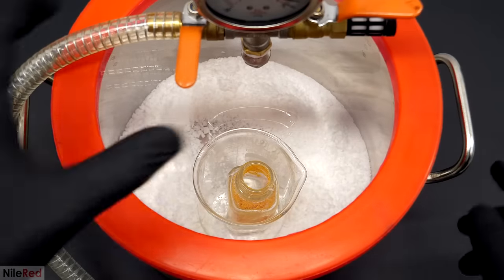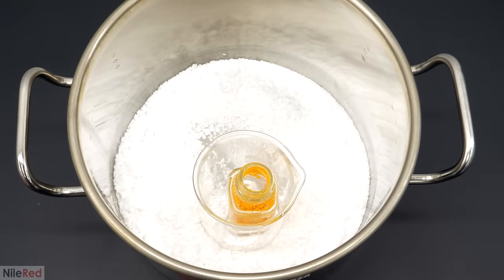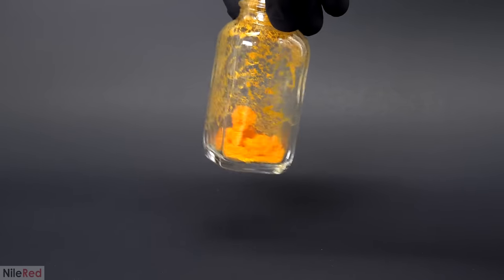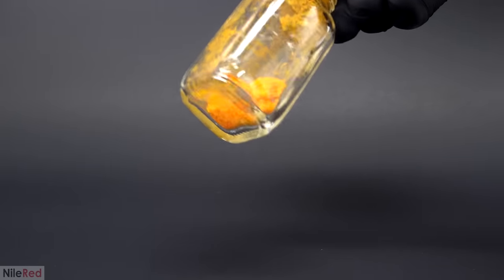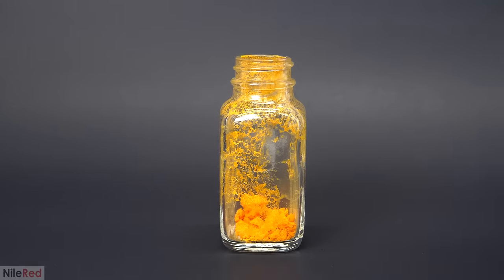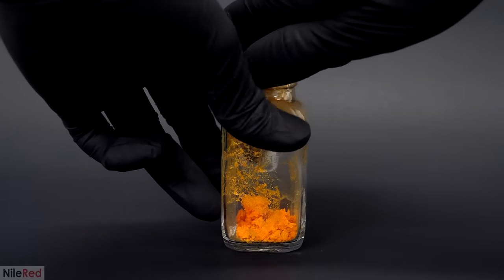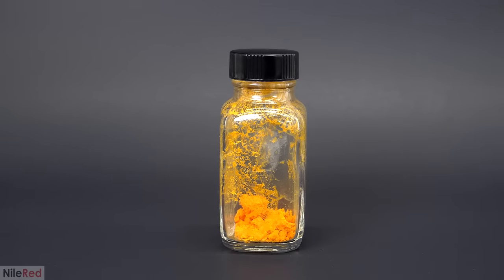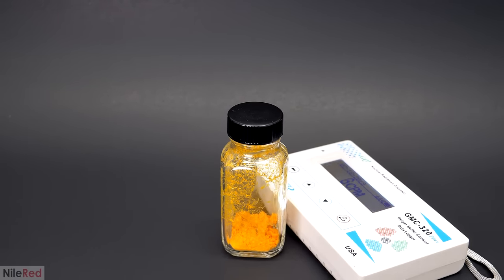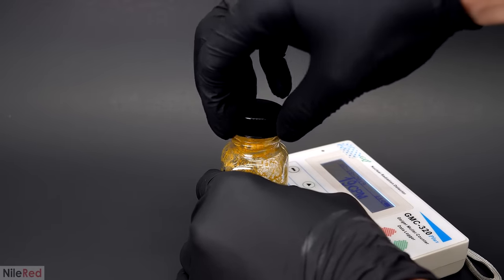I came back a few days later, repressurized the chamber and took it out — and it worked, it was really dry. When it's dry like this though, it has a tendency to give off dust and powder, which is obviously really horrible to breathe in. This was why I only dried it completely in the final container that I was storing it in, so I wouldn't have to move it around or handle it. I went ahead and weighed what I had and it came out to be 9 grams, which was about what I expected. Just for fun, I decided to test it with the Geiger counter, and you can see that the glass was able to block most of the radiation.